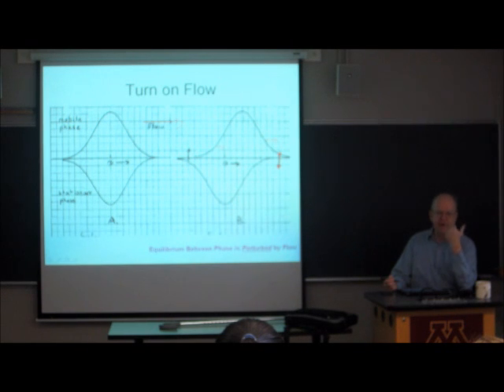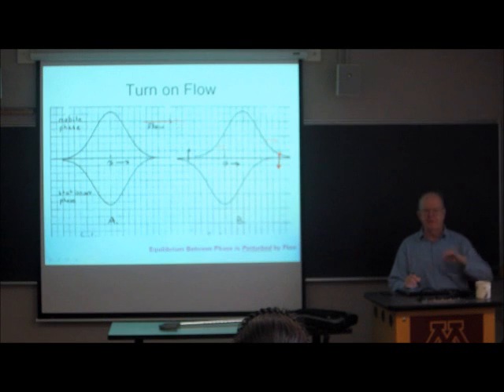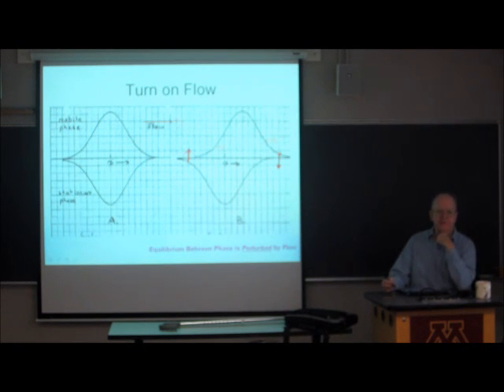Conversely, at the tail end of the peak, the molecules in the stationary phase that are lagging behind don't observe any molecules of mobile phase directly above them, and so they feel a diffusive gradient that will move them up into the mobile phase, attempting to reestablish equilibrium.